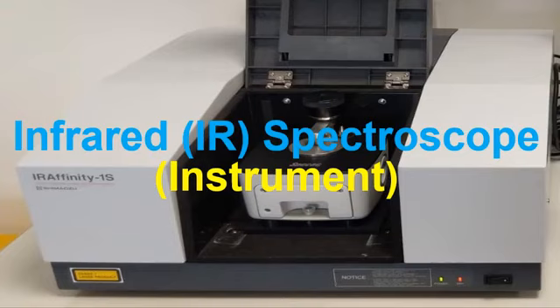The technique which is based on the infrared spectroscope is known as infrared spectroscopy. Dear student, the infrared spectroscope is an instrument which is based on three basic parts. The first part is known as the IR source region.